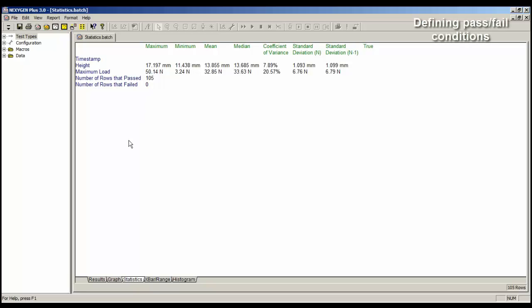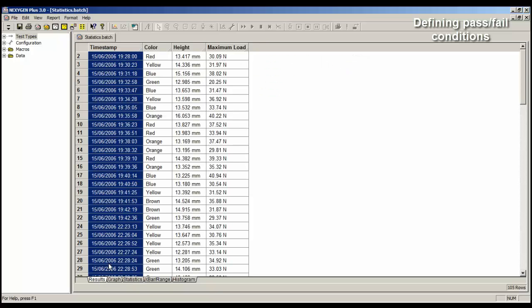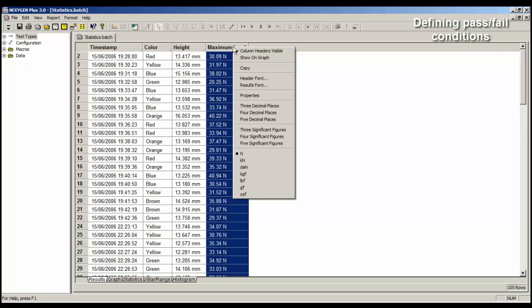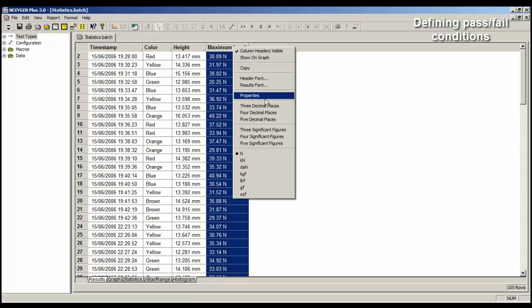We'll go back to the results table, and we'll select a column to add a pass or fail condition, and in this case I'm going to use maximum load. So right mouse click on the maximum load column. We have a menu displayed. We will select Properties.